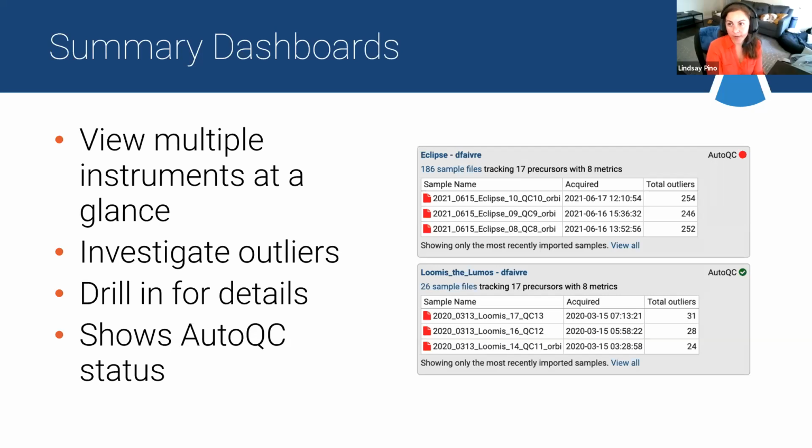Yeah, that gets at another question from Pavel, who is asking about if you have one instrument and multiple people are running different types of experiments, so they're switching columns on and off, should that look like a single instrument configuration where everybody shares their QC, or should each person have their own QC folder? I think that gets at that same question.